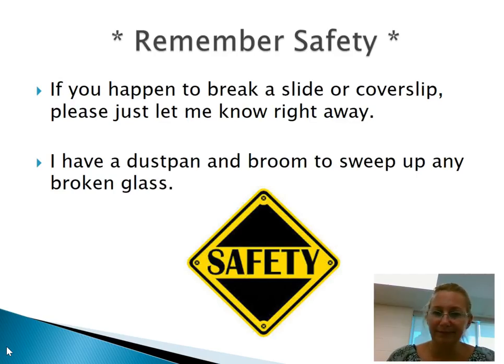Now remember, we're going to be having glass slides and glass cover slips. If you happen to break one, and it could potentially happen, make sure you let me know right away. I'll give you the dustbin and the broom, and we can clean up any broken glass. It's going to go into that broken glass container. And again, if you do happen to cut yourself on something sharp while we're doing the lab, let me know as well. Okay, so always remember your safety.